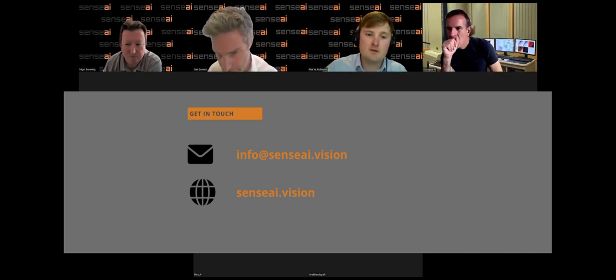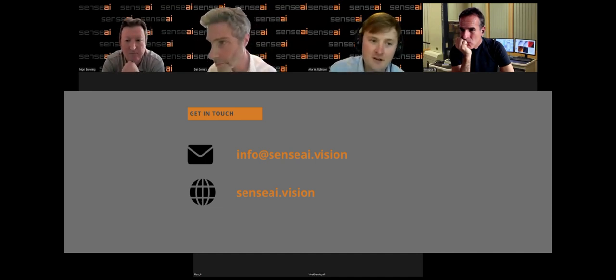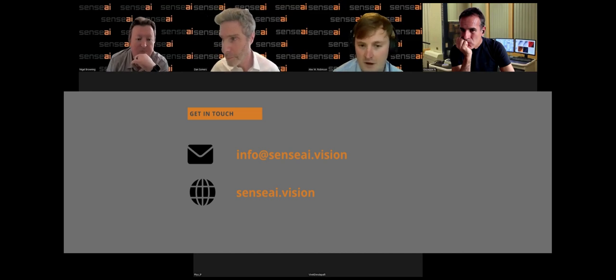Yeah, so with Gaussian filtering, what will happen is those higher spatial frequencies in your image will be blurred down. Whereas in our approach, we're preserving that and in fact actually increasing it by using much higher frequency dictionary elements to reconstruct that. So in one case study, we found that we managed to improve the effective resolution by a factor of 2, just looking at that using that dictionary transfer approach from the simulated data.